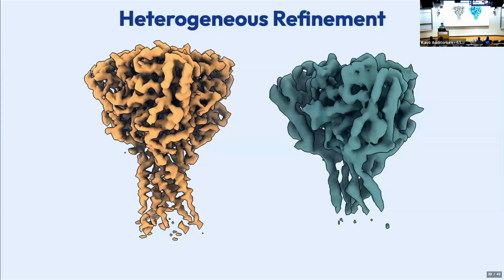While we're on this, I'm going to interject with one Zoom question that's very heavily related. The person is asking, let's say the holo form is quite rigid, so you have one 3D class that might absorb all the particles for that, but the apo form has two distinct sources of heterogeneity: potentially partial occupancy, but also continuous flexibility. What approach would you want to try? Could you, for example, try a 3D classification with many classes to capture all the states of the apo particles? I think this is going to be covered quite a lot in the next session.